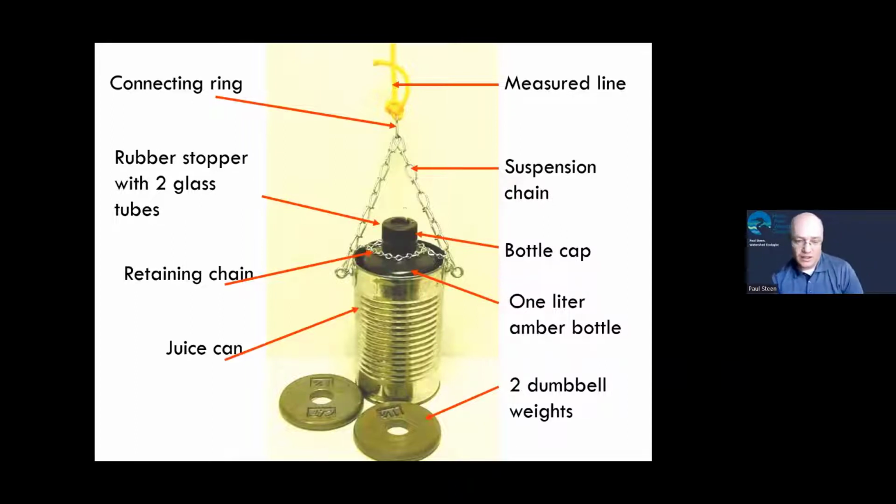So you drag it through the water column down to up, and it collects water as it goes. So it enables you to get water at the bottom, in the middle of your lake, at the top of your lake, all mixed together. That's why it's called an integrated sampler, because you're integrating all the water depths.